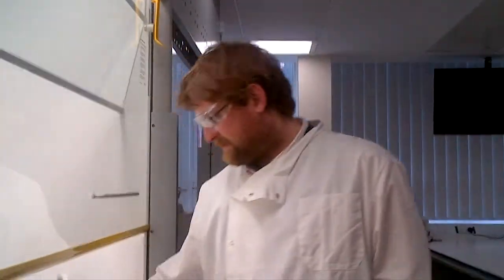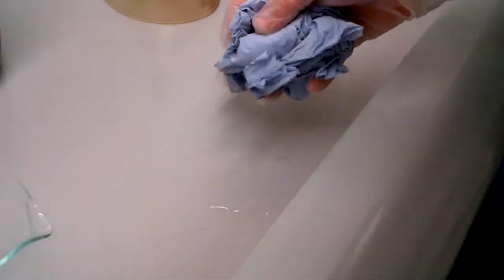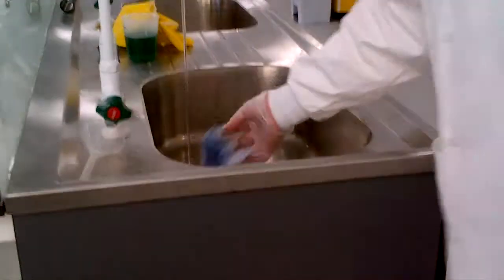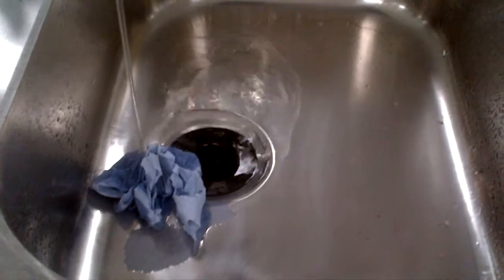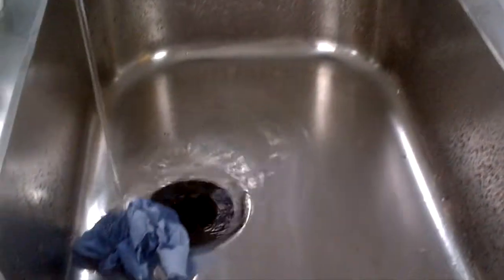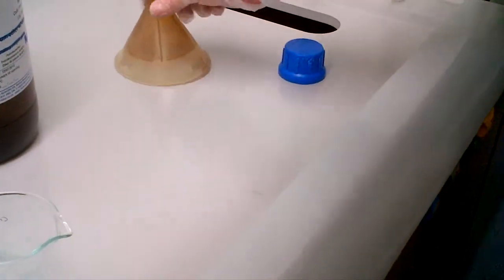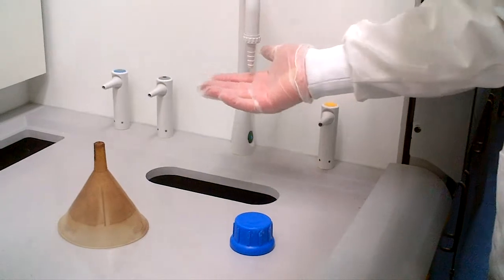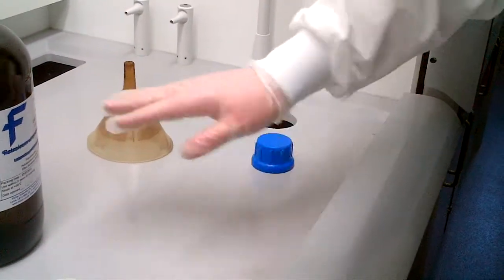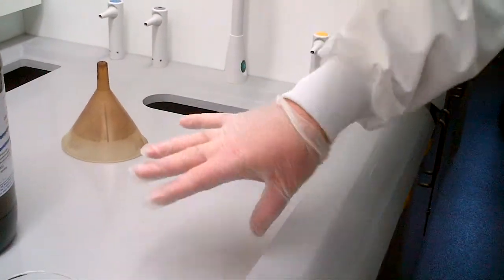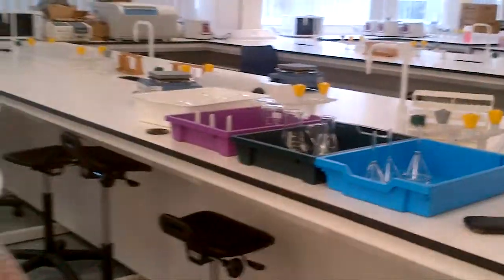Should you spill concentrated acids during the course of the day, concentrated bases, we don't want to be leaning in this. If it's concentrated acid, what do we do? Well, we'll get some paper towel again, we will mop up, we will take our paper towel, and with concentrated acid, this must go into the sink and let water run over the top of it. You should leave the paper towel for a period of time, like five minutes. Excess paper towel to clean the area, you might then need to apply water, from the tap onto a sponge, or beaker with water. We don't want to see acids spilt in this area, so we trust you with a fume cupboard space, or likewise with a bench, we ask you to clear up.